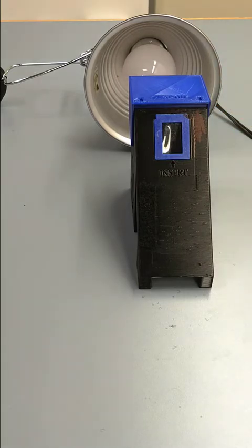And we need to use that to collect the spectrum, and then we'll replace that with a compact fluorescent light bulb, which has discrete atomic emissions or line emissions, where we know exactly what frequency or what wavelength those emit over. That'll allow us to calibrate the wavelength scale on our phone. So I'm going to walk you through both of those steps.